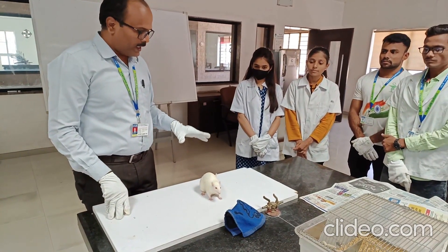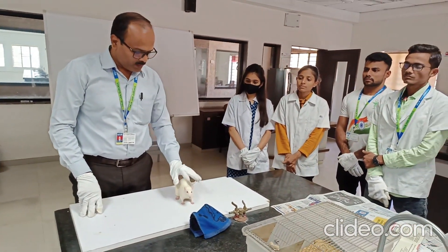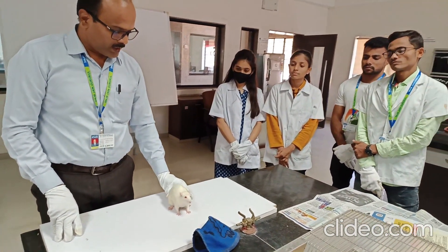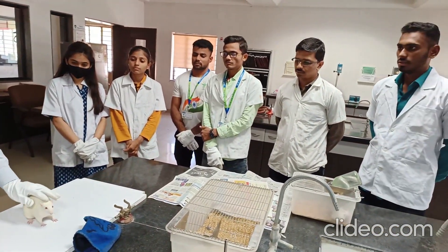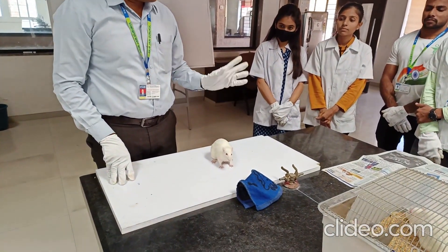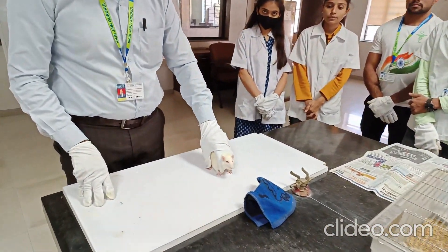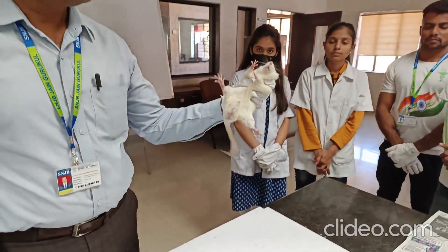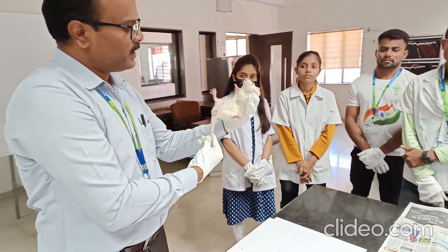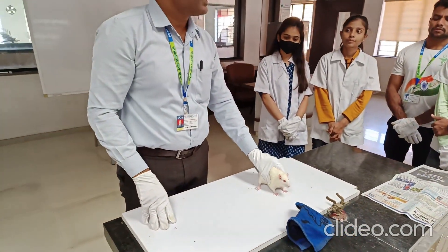How to handle the rat? If the rat is normal, first make the animal acclimatized. Then, using two fingers, pull the skin of the neck, and hold the thumb below the forelimb. This is the way you can hold the rat. If you want to give dosing, put the tail in position and administer the dose. This is the way by which you can handle the rat.